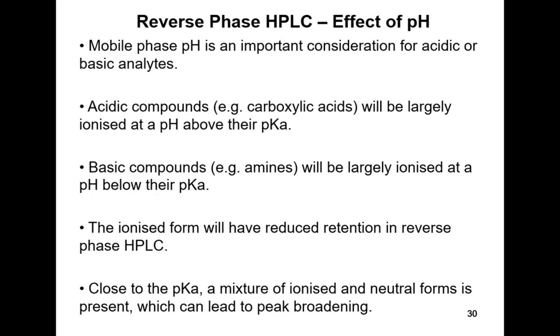So if we had the mobile phase at the wrong pH, we were getting chromatograms kind of like this. But if we adjusted the pH, suddenly this almost imperceptible rise in the baseline sharpened up into a nice proper HPLC peak.